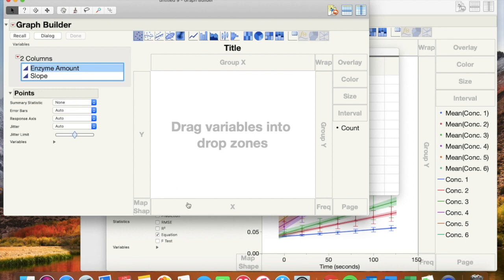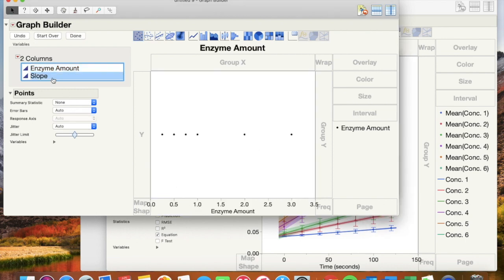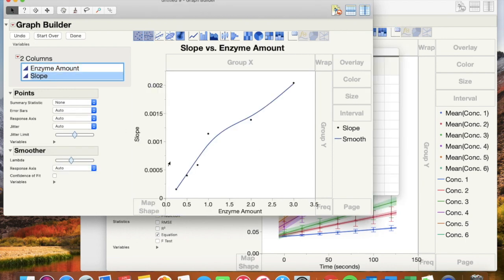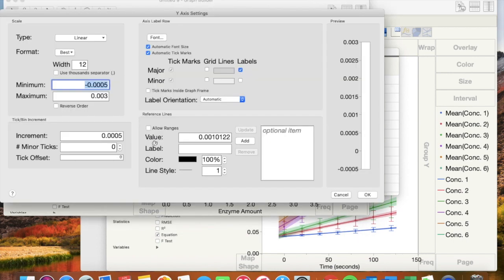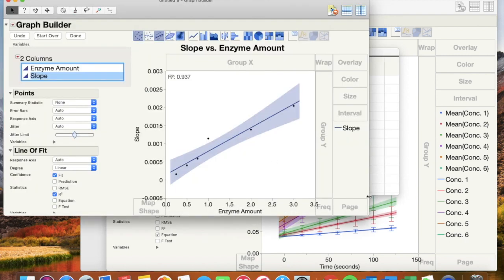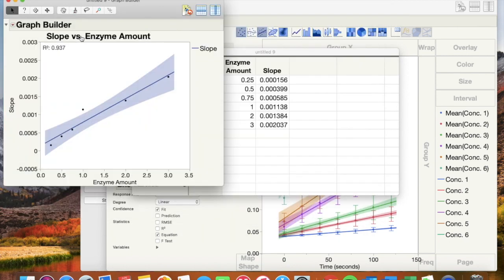Enzyme amount is x-axis and slope is y-axis. Choose to display a linear line with the R2 value. Modify the graph as shown. This is your enzyme concentration graph.